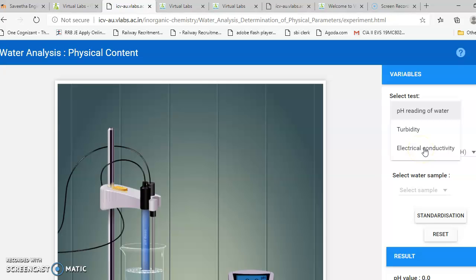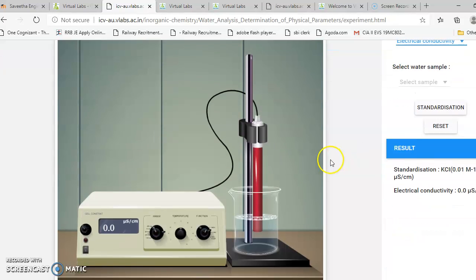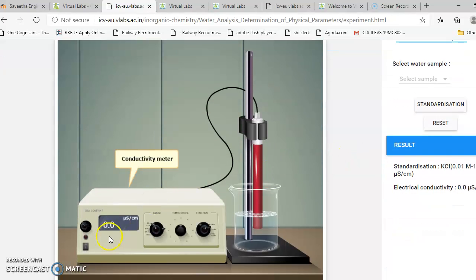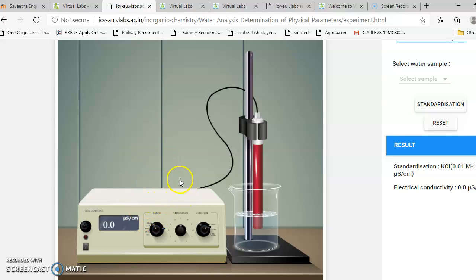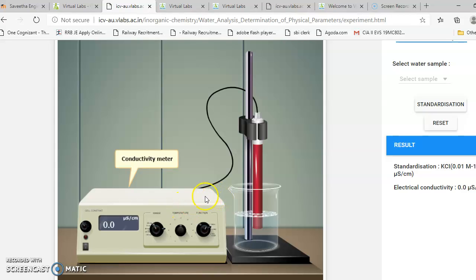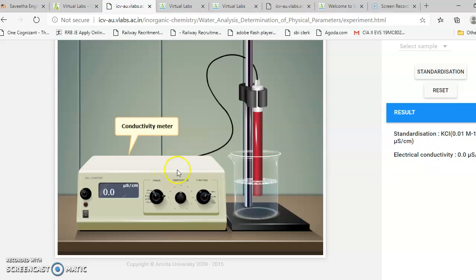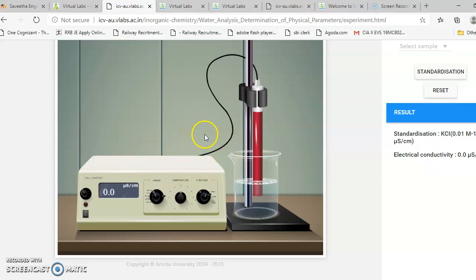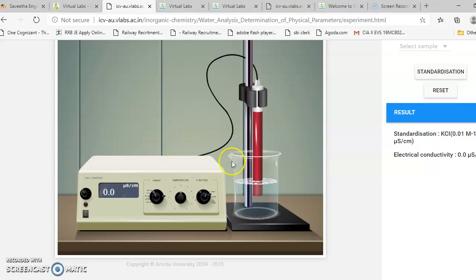Here you can see we can measure pH, turbidity, or electrical conductivity. Let me introduce how to measure electrical conductivity. This is the conductivity meter we have already seen in the first three experiments, which were related to conductance measurement. Today I am going to introduce Kohlrausch's law — how to do the verification of Kohlrausch's law — which is also done using the conductivity meter.